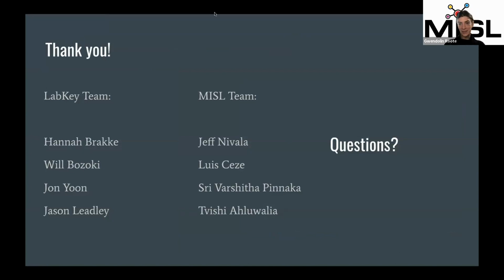Yeah, thanks again. Thanks so much, Gwen. I think it was really great to hear from you, and the story that you shared for your lab is very familiar for a lot of the folks on the call. So you're certainly in good company. There's been a few questions that people have posted to the Q&A, so feel free to add those in, and I'll be asking Gwen some of these, and then I've got a few of my own, of course.